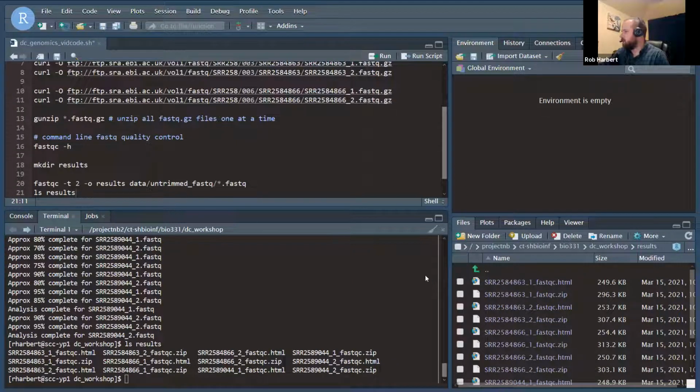Okay, so if you've done this exercise, go through and look at all of the HTML files, not just 2, but I'm not going to keep recording for that. I'm going to go sift through a bit more data here and see what we have to work with coming up.